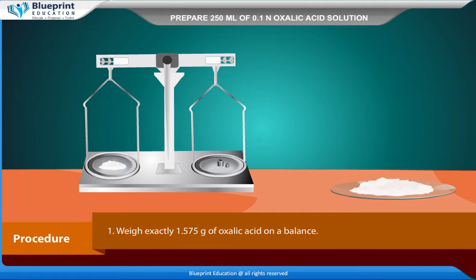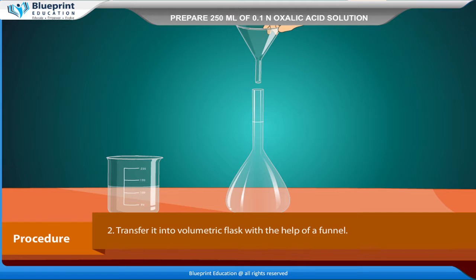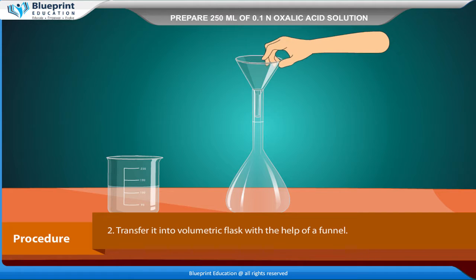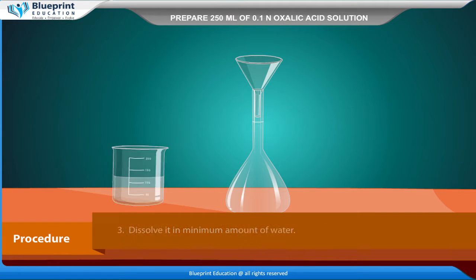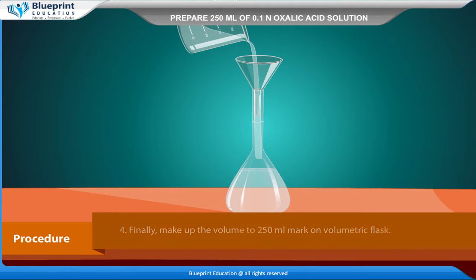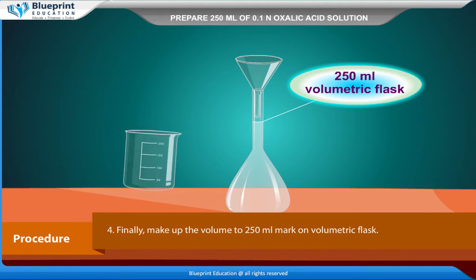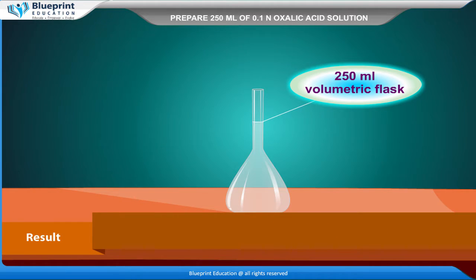Procedure: Weigh exactly 1.575 gram of oxalic acid on a balance. Transfer it into a volumetric flask with the help of a funnel. Dissolve it in a minimum amount of water. Finally, make up the volume to the 250 ml mark on the volumetric flask.